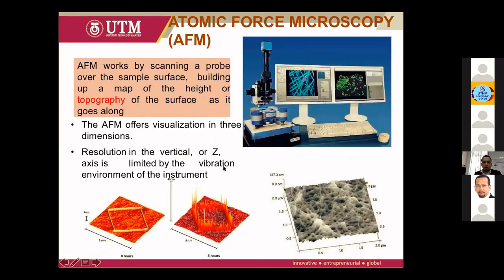Last but not least, the one that I would like to emphasize today is the AFM. AFM is a bit tricky, because you have to know that not all samples require AFM. You require AFM imaging when you need to determine the topography, meaning that it's not only XY but the Z axis. The Z axis of the sample is important.